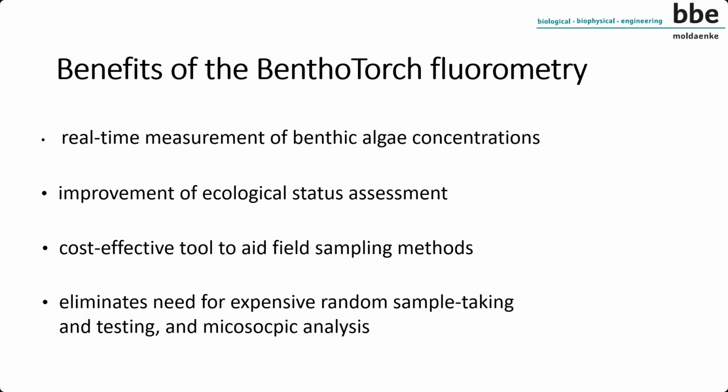Yeah, and compared to microscopic analysis, of course, it is not that clearly comparable, because the level of analysis is much better for microscopic analysis. But to get rough information about the different algae classes, I think it is a fair way to determine the ecological status and the families of algae and cyanobacteria inside of a sample.